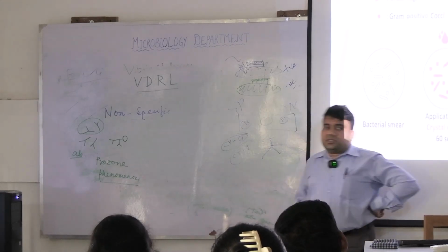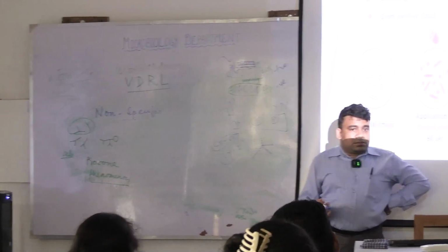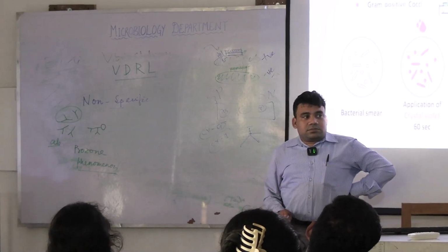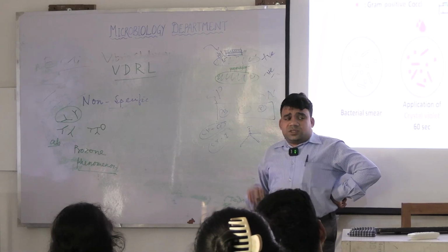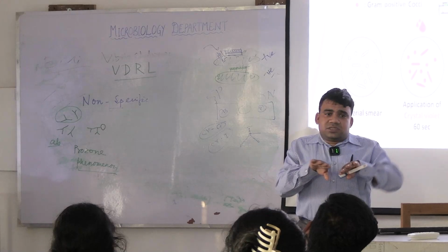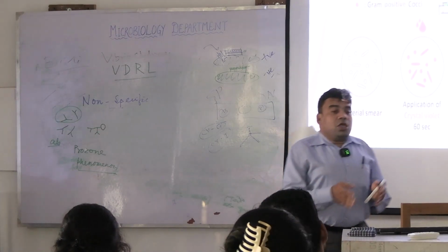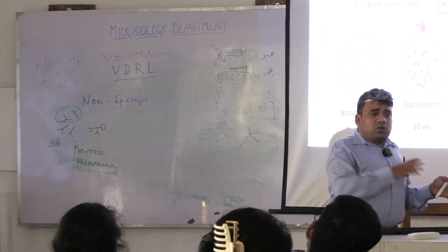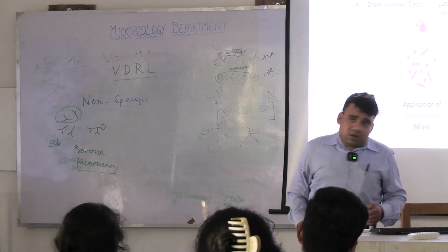Now because it's a three-dimensional structure, it cannot now get out through the pore channels. The only way it can go out is if the cell wall is damaged. This is where acetone or alcohol comes. With the exposure, acetone or alcohol dehydrates the cell wall, and when something dehydrates, there will form cracks on it. If we can time the decolorization properly, we can damage the peptidoglycan layer of the gram negative wall without damaging the gram positive wall. This is how crystal violet iodine acts.